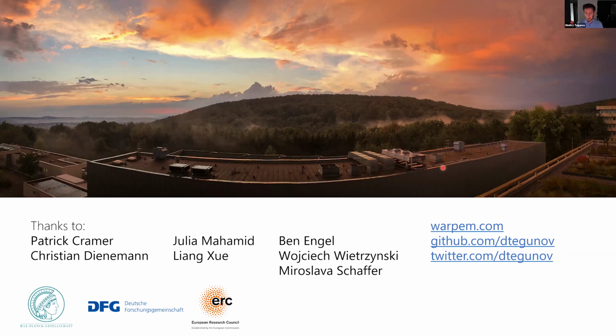And I really wanted to have it released and the preprint online before this talk, but then Corona canceled that plan, at least for the time being. But it will be out very, very soon, I can promise that. But if you're interested in using Warp, Membranorama, or other pieces of software, you can look those up in my GitHub repository.